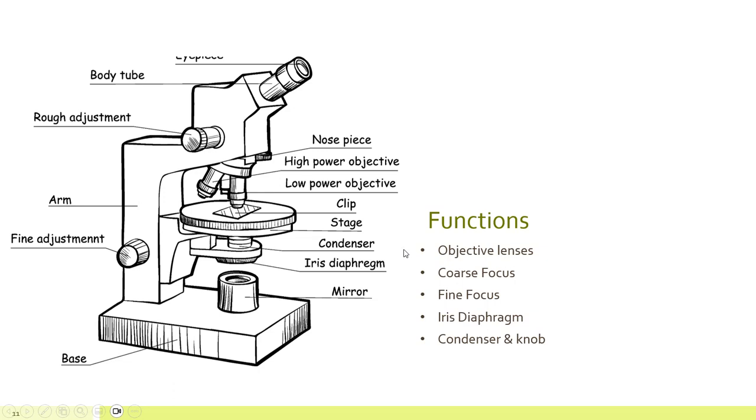One of the things that I wanted to highlight, these things here, and the reason for that is because the things that I have highlighted here are important for the work that we're going to be doing with these microbes. These microbes actually have the same refractive index as water, meaning that if you were to shine light through them, which we are doing with a microscope, you wouldn't see them unless you would shadow them, right?